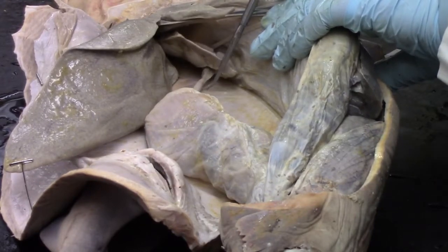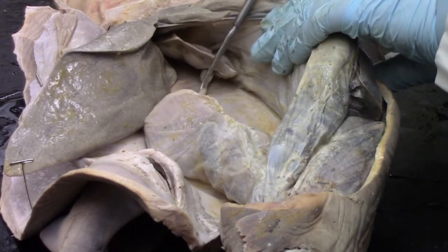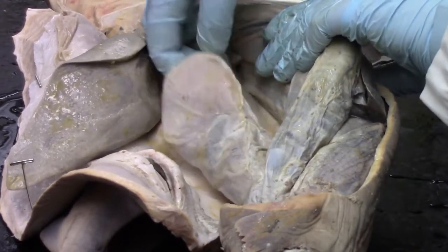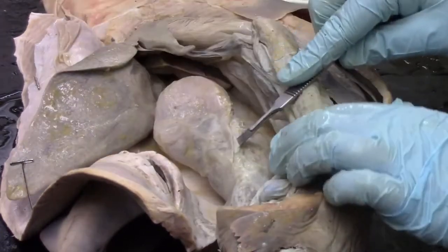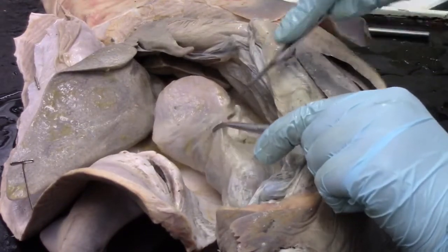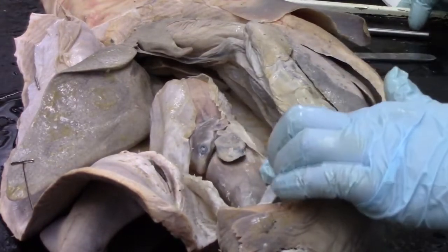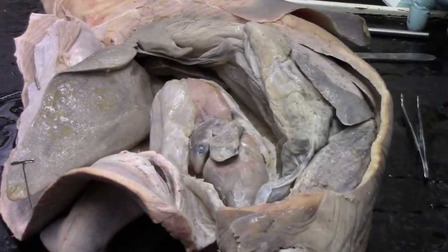So the oviduct, the human equivalent to this would be the fallopian tube, but we generally say fallopian tube when we're talking about mammals, so let's call it an oviduct. And that will make its way all the way to the uterus. We'll open one side of the uterus so that you can see the developing young. So right in here we have some young shark embryos.